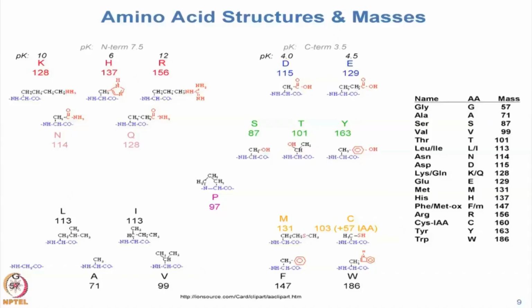But what you really need to know is how narrow those peaks are going to be, and are they narrow enough to do things that are useful? TMT10 resolution is something we're going to talk about later, and the ability to resolve the N and C isotopes of TMT reporter ions is important. Okay, all right. So I've already said the gap there was 0.25, right?